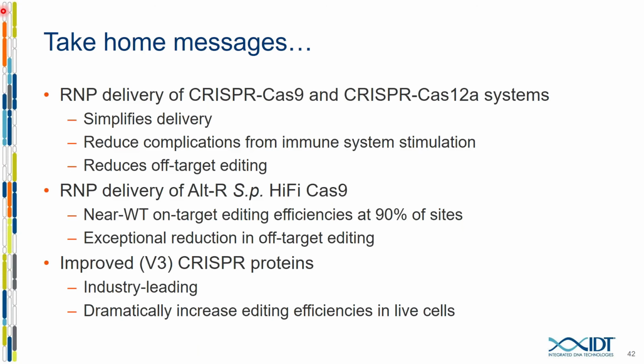But you could empirically test it and try. I just think it's going to be kind of a mixed bag of what sites work and what don't. And the same is going to be true for wild type in some cases. So I would recommend using a chemically synthesized two-part system or single guide RNA where you're not introducing non-templated nucleotides.